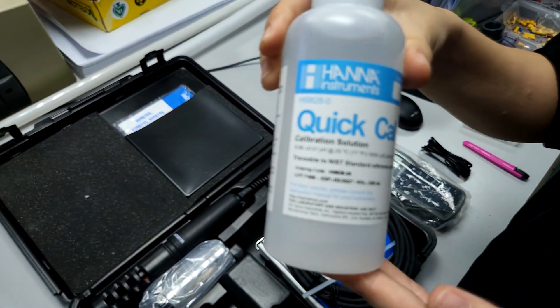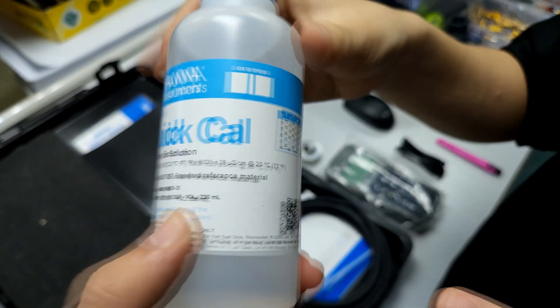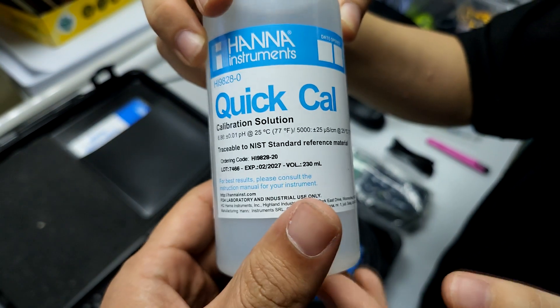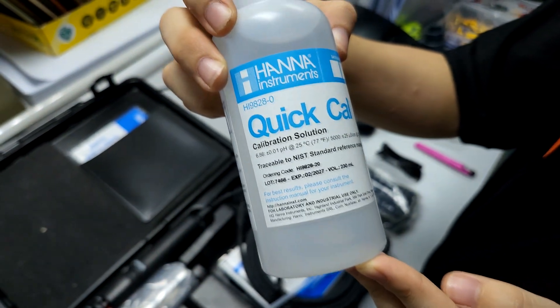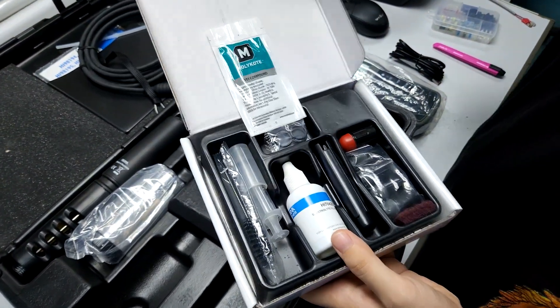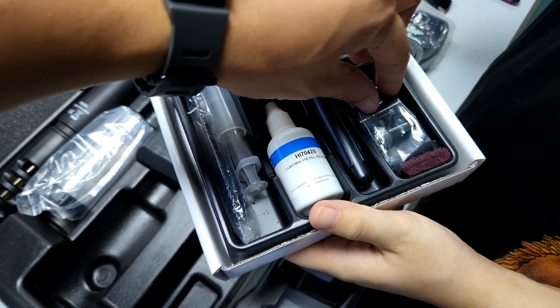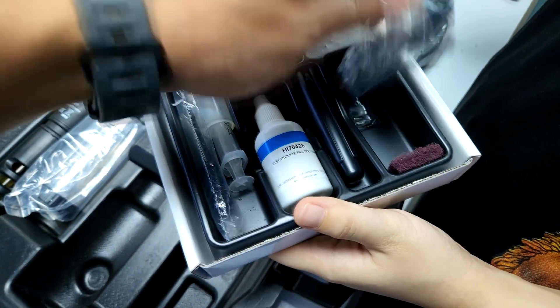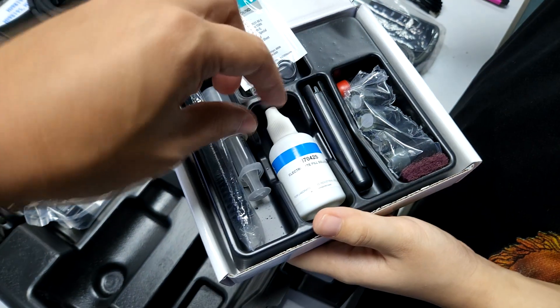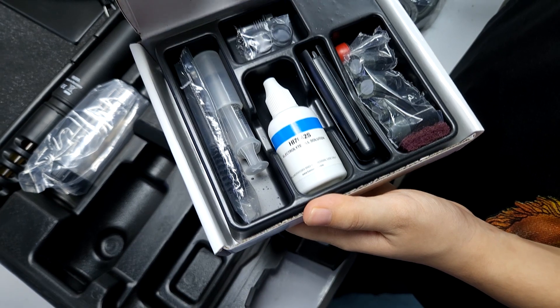This is a calibration solution for the pH — it's a big one so you won't run out quickly. The pH probe actually requires more calibration compared to the DO probe. This is how the DO probe solution looks like. It also comes with new membrane caps, which in my opinion should be changed every two to three months along with refilling the electrolyte solution within the membrane cap and the probe — this is also provided.